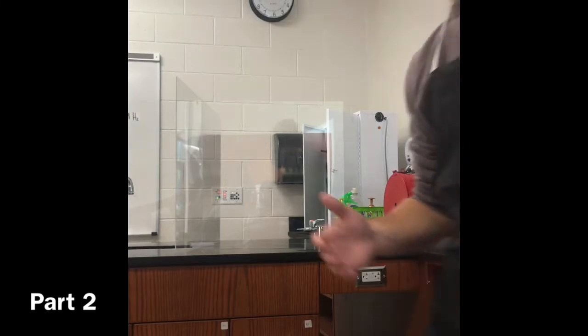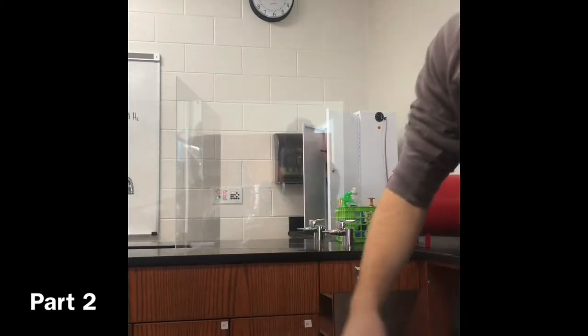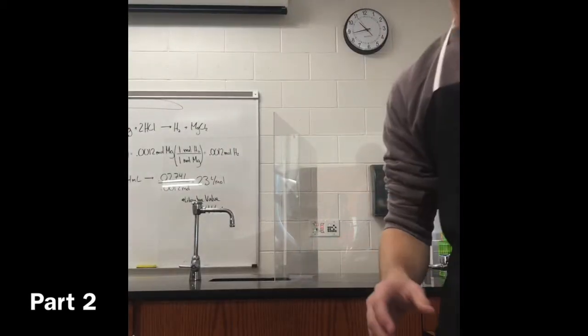Check. Is this looking good? A little bit this way. What? Alright. Okay, let me. Has it started? Yeah. Oh, it is? Well, I can just delete that part.